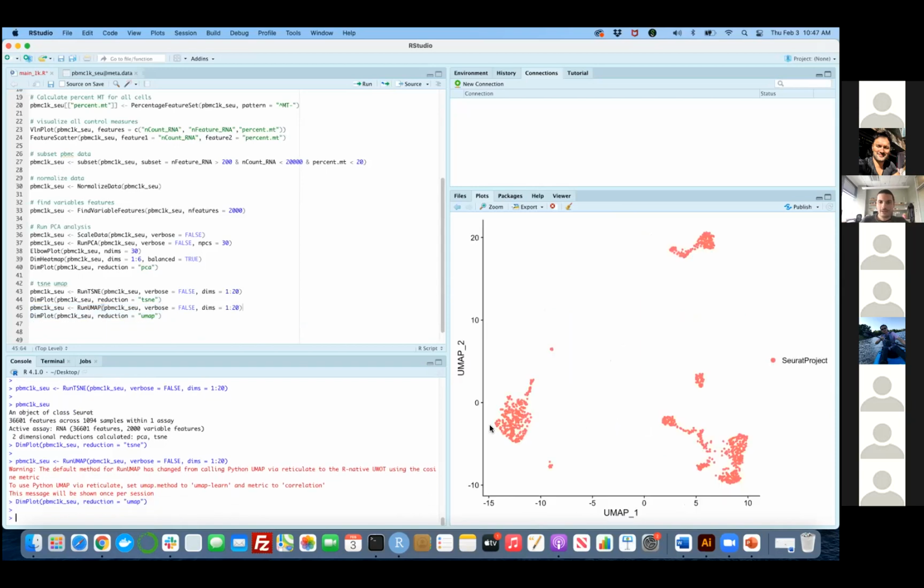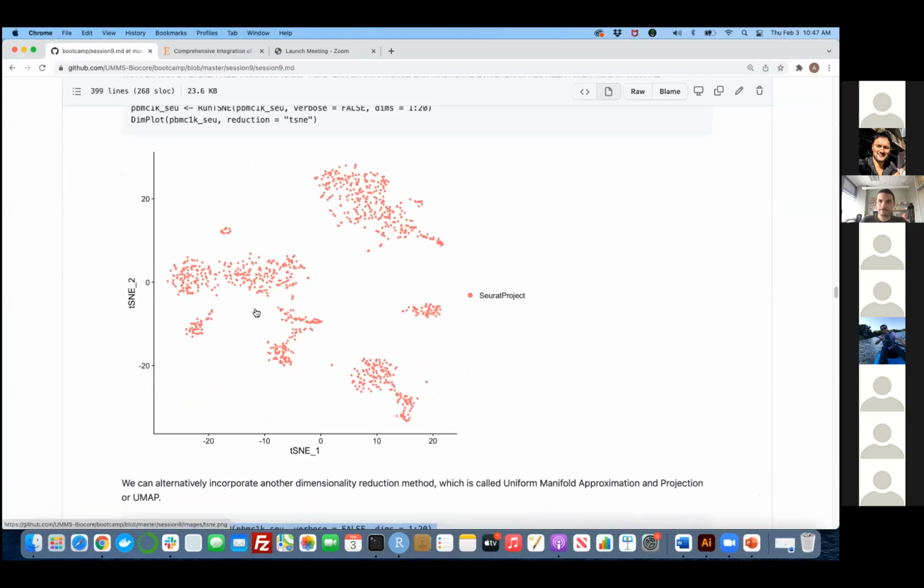clustering pattern. Again, you're picking up some clusters. You can see that maybe this is a cluster, this is a cluster. This could be a cluster, by the way, because it has some distinctive shape as opposed to this main cell island that we have. This could be a cluster and that could be a cluster. The theory behind these two visualization methods to two dimensions is different, but they are basically showing the same thing. They are revealing the possible clusters over here.